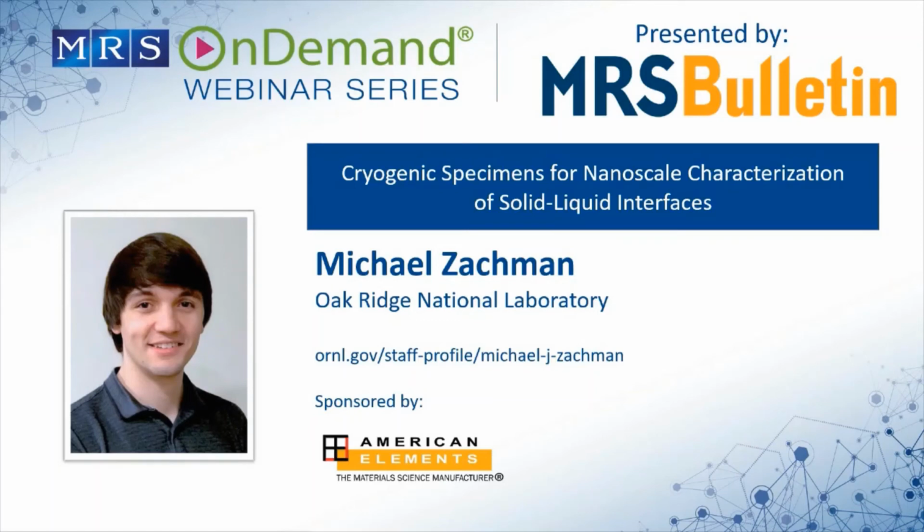You again have to worry about beam damage, and it's actually, I think, from my experience, a little harder to diagnose when your damage starts to happen because you can't look at that fine structure. You have to basically rely on structural changes and mass loss, which is not the onset of damage from what we've seen. But in principle, you could do a lot of this stuff down to at least 100 nanometer type resolution, and we've gone down to maybe 10 nanometers or so if you have the right materials. So you can do a lot in the FIB, and I think that's where a plasma FIB actually would be useful to expose new things and more of them than we can right now. Yeah. We'd look for more instrumentation development, I think, in that area.